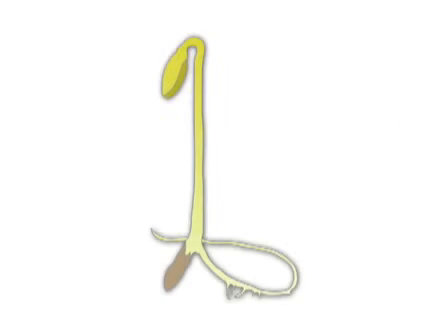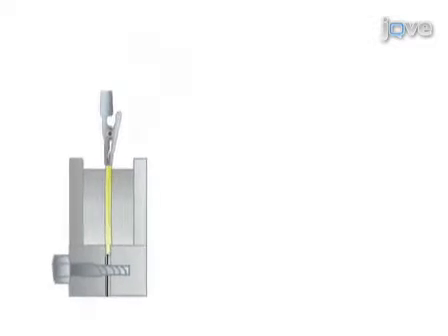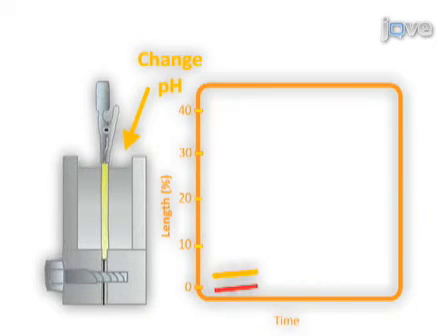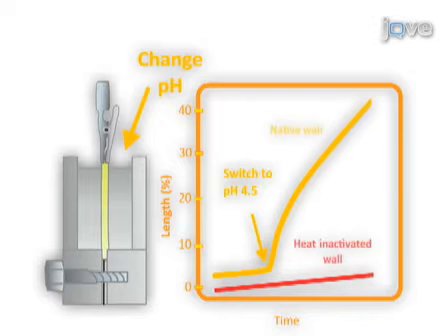Here we demonstrate methods for measuring expansin activity by cell wall extensometry. Suitable wall specimens can be prepared from the hypocotyls of etiolated cucumber seedlings. To measure acid-induced extension, which is catalyzed by endogenous expansins bound to native cell walls, we clamp the walls in neutral buffer and an extensometer. Upon switch to acidic pH, expansins are activated and the cell walls extend rapidly.